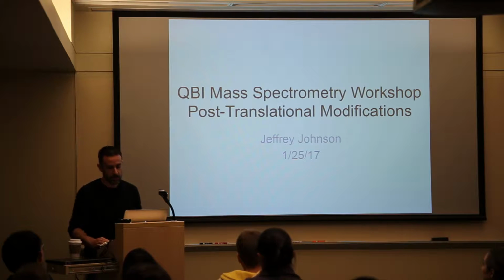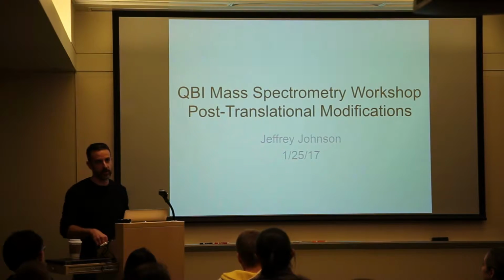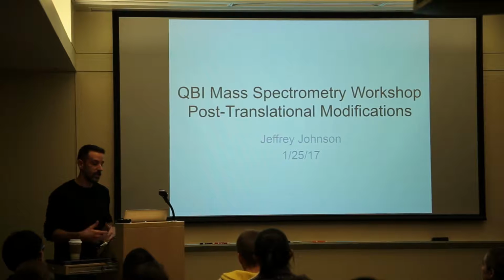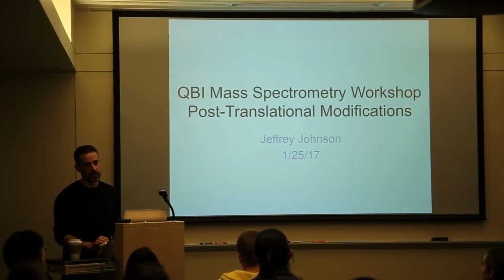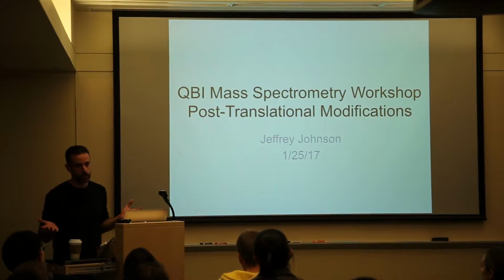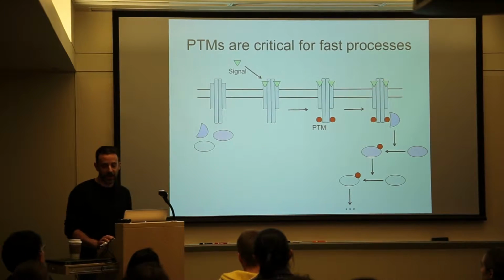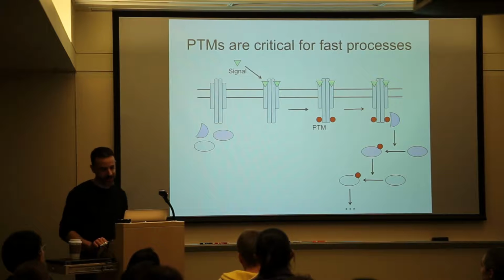I think when you talk about mass spectrometry and how the technology has advanced in the past 5 or 10 years, it's really easy to see how powerful it is when you look at post-translational modifications. There are a lot of things that I'll talk about today that you probably couldn't have done even 5 years ago. So it's really technology that opens a whole new field of research that couldn't be seen before.